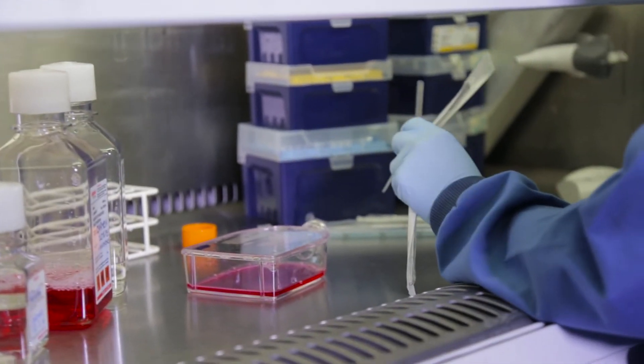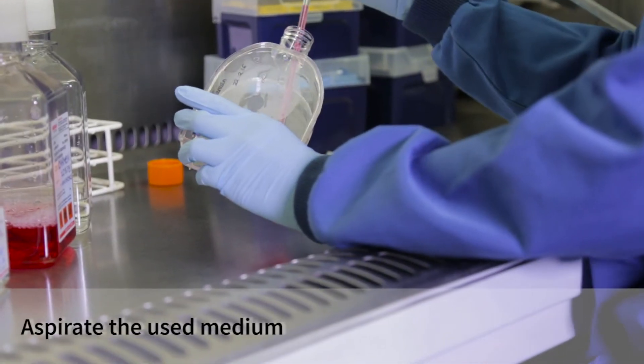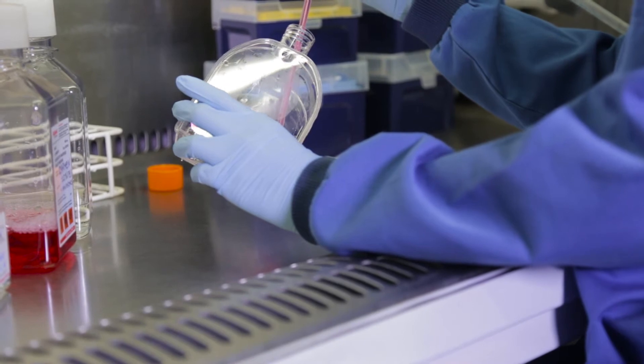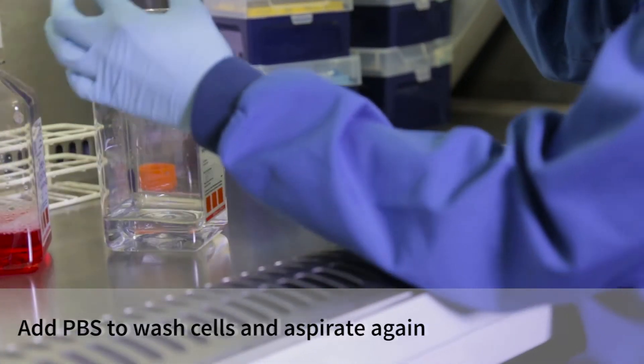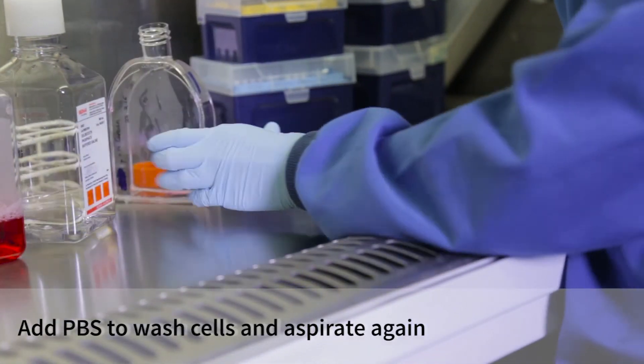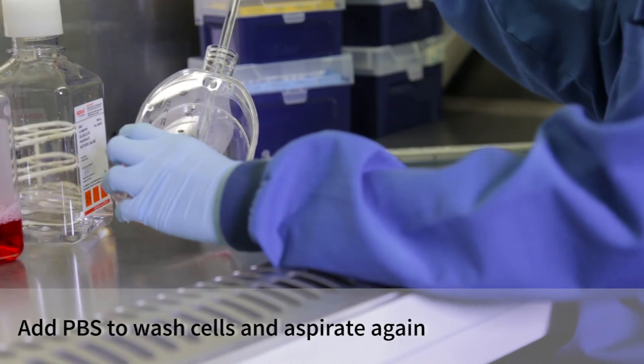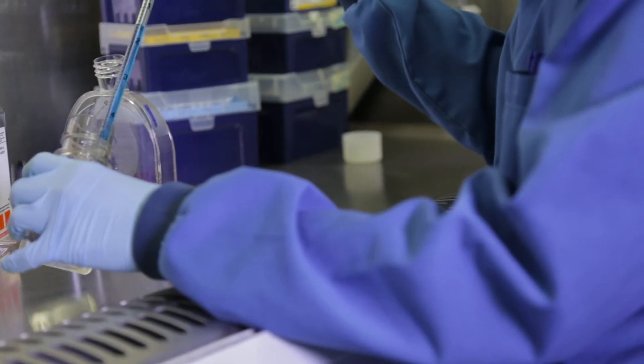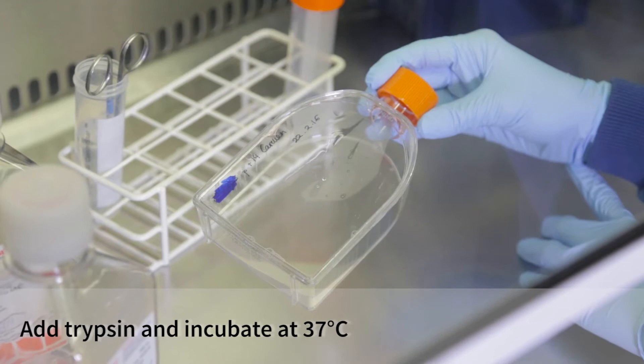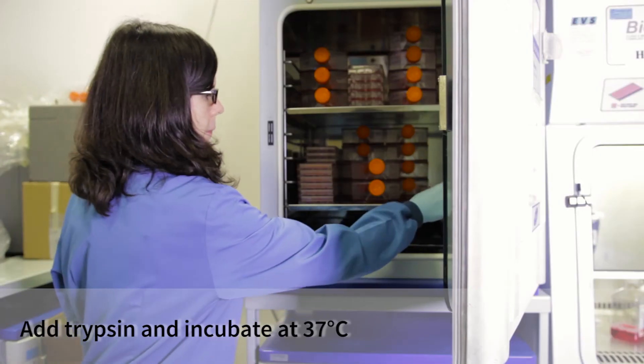Now, I would like to show you how to collect cells from the flask. These cells are adherent. That means they grow attached to the surface of the flask and I will have to detach them. The first step is to aspirate the used medium. After that, I add PBS buffer to wash the cells, which are attached to the bottom of the flask, and aspirate again. Finally, I add the trypsin and incubate at 37 degrees for 5 to 10 minutes.